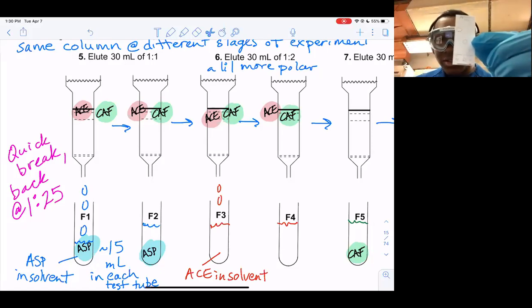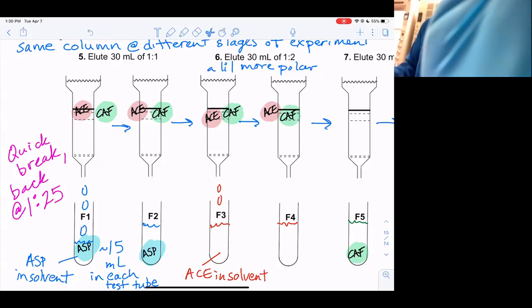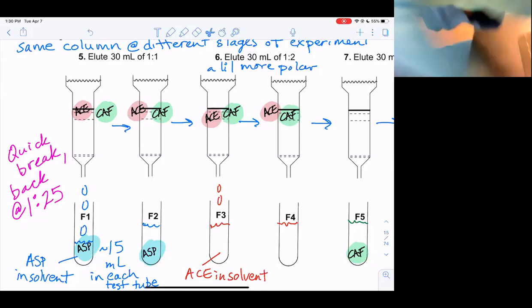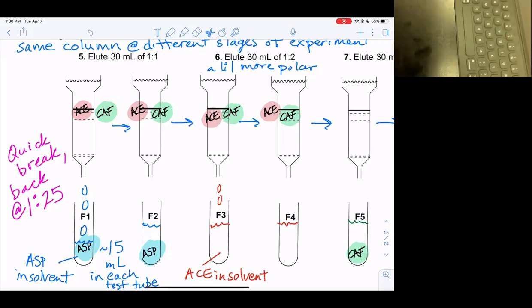So this is a plate. Yep, I was just saying farther back is too close. That's good. So if I turn on the UV lamp, let's see if I can take this to show you guys. It's weird that the camera is on the top. Can you see that? Or can you see my hand?